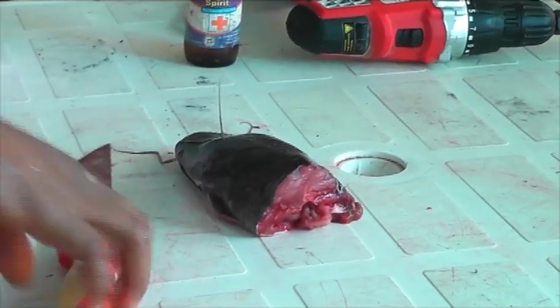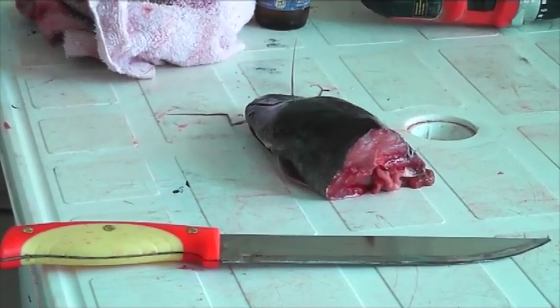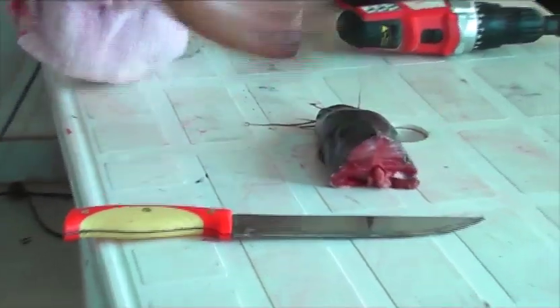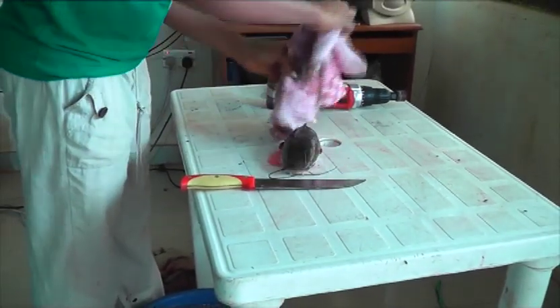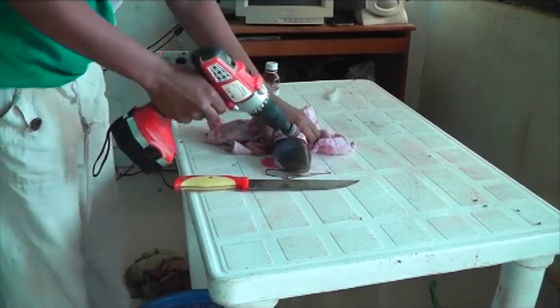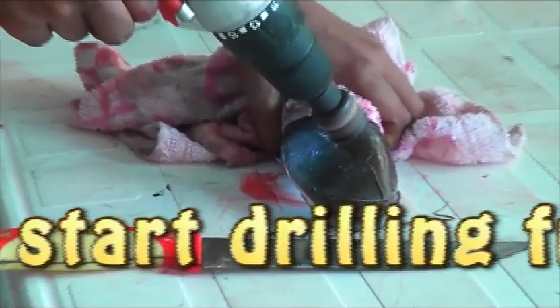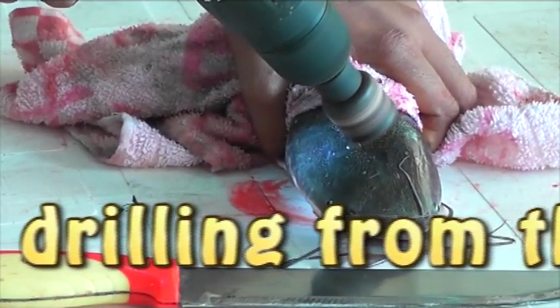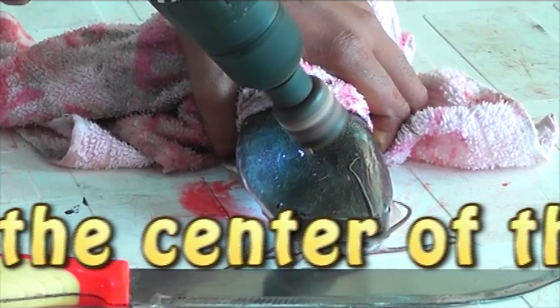Clean your knife. Position your fish for drilling so that you can now remove the pituitary gland. Get your drilling tools ready and start. Begin drilling from the center of the fish head — that is where the pituitary gland is seated. It is fully protected.